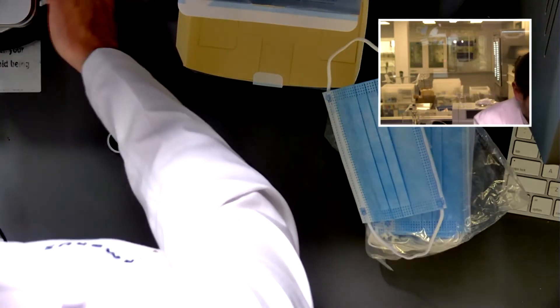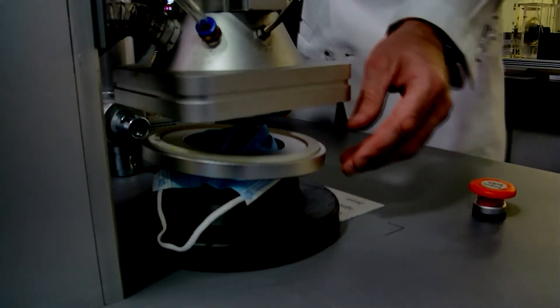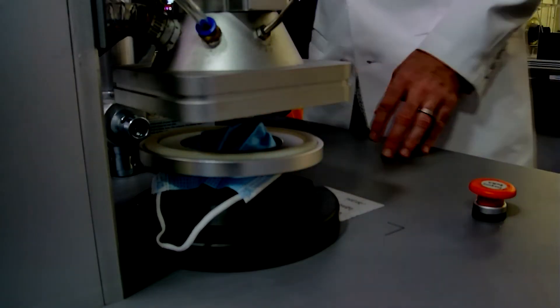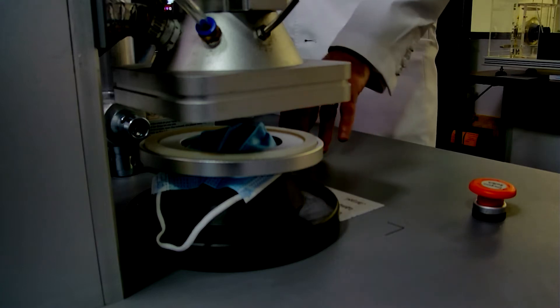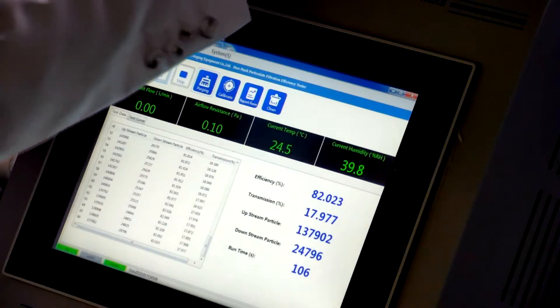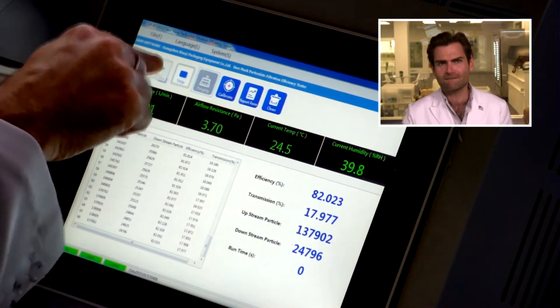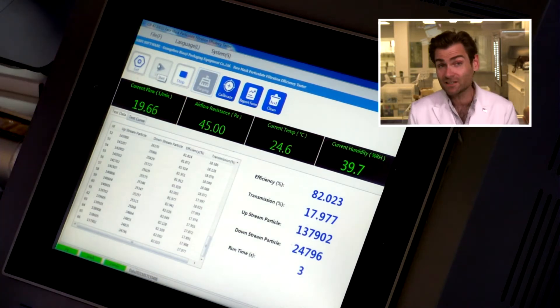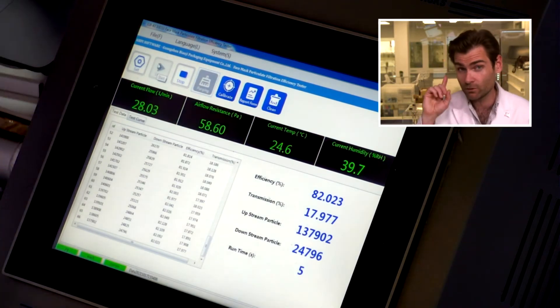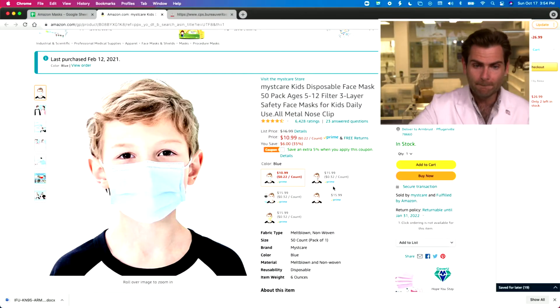We're using a different clamp than we normally would for surgical masks, because we're using these itty-bitty teensy tiny kids masks. This is a PFE machine — particulate filtration efficiency machine. If you want to find out how this thing works, check out the link. We're doing the ASTM test, the American standard test for surgical masks today.